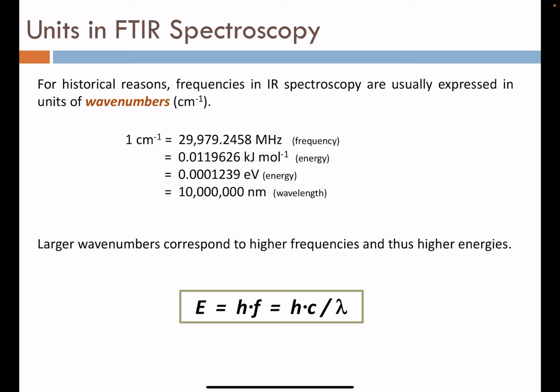We mentioned the wave number briefly. Let's consider some of the math. Of course, we know that the energy of a photon is related to Planck's constant and its frequency. Here, frequency must be in hertz, and this gives energy in joules, with Planck's constant as 6.626 times 10 to the minus 34 joule seconds.